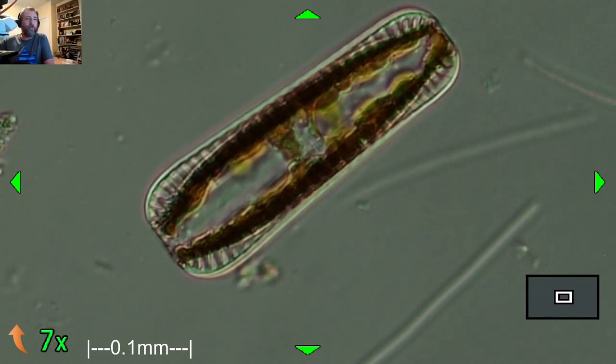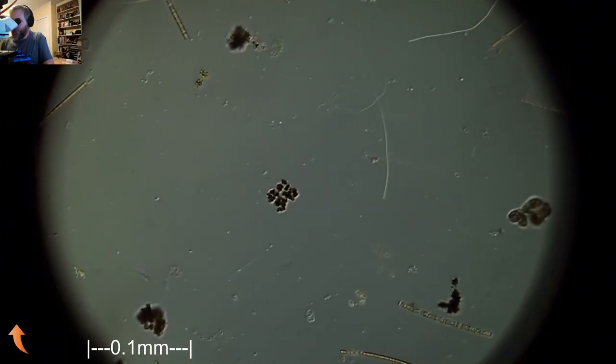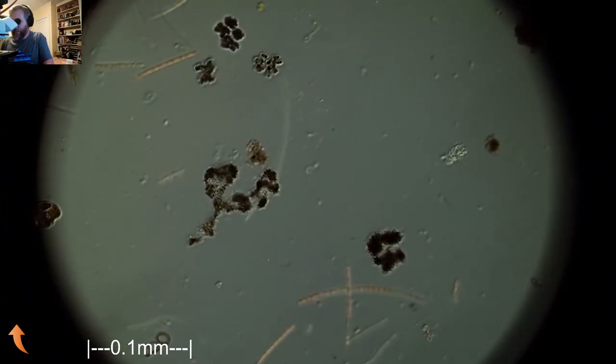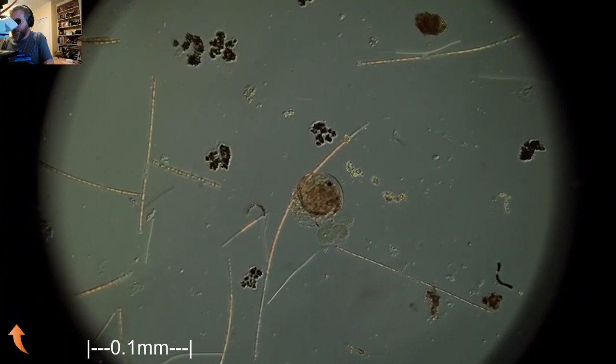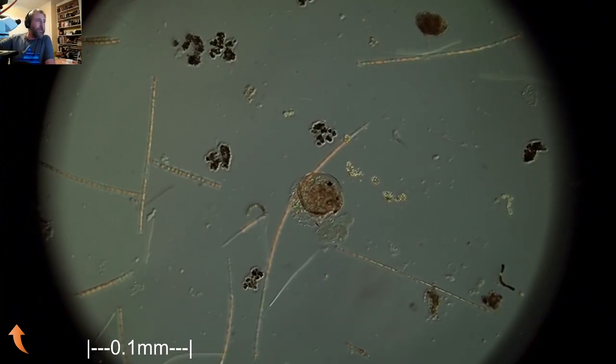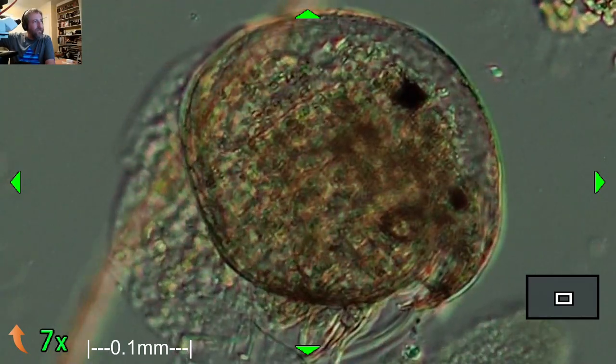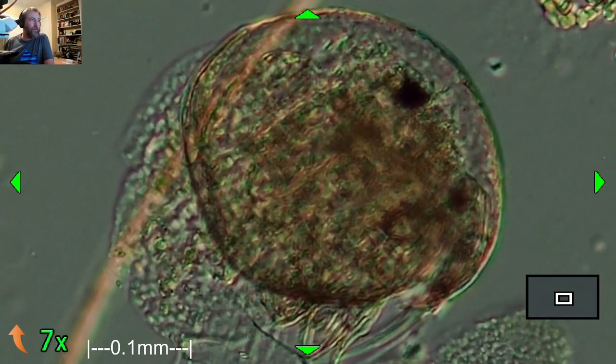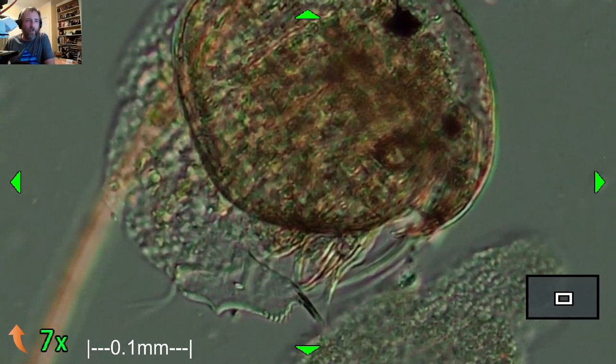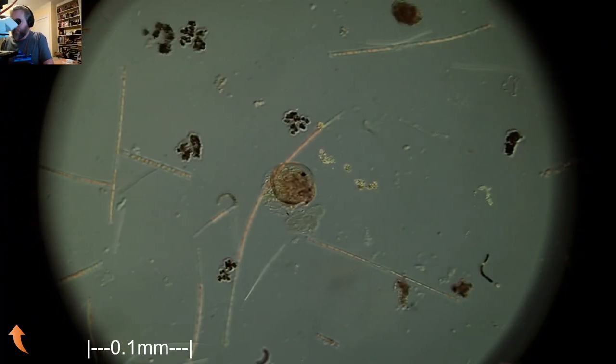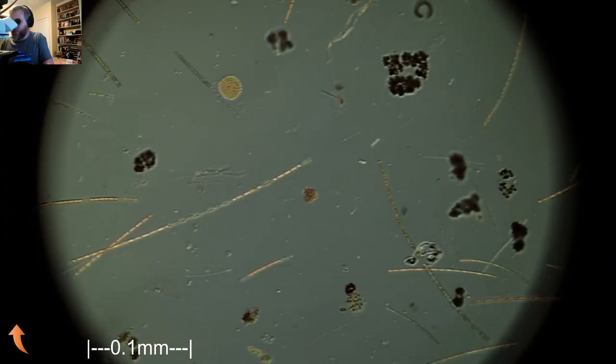That's a girdle view of the diatom. Probably if we asked my student Addison, who's working on the paleo record from this site, she could probably tell us what the species of Cyrella is. I have no idea which one that is. That's the body of a Chydorus, right there. See, they have a little tiny snout. And then it's got a big foot that sticks out the bottom of its body. I think it's dead. You can see a bit of the foot right there. It's got the little spines on the edge of it. That organism doesn't exist anymore. Just its skeleton.